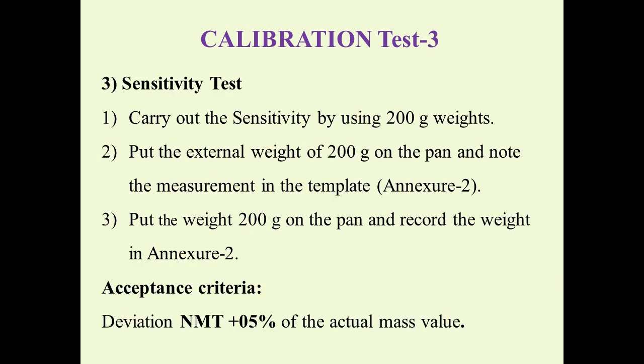Sensitivity test. The test weight must correspond to the maximum load of the balance for routine work. The test must be carried out before work starts, or at least once a day. Carry out the sensitivity test by using 200 grams weights.